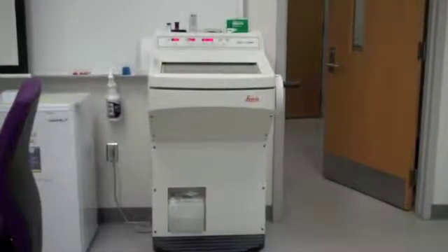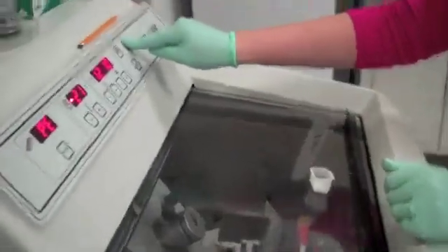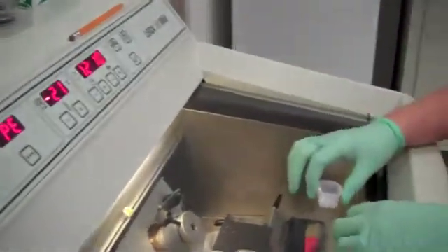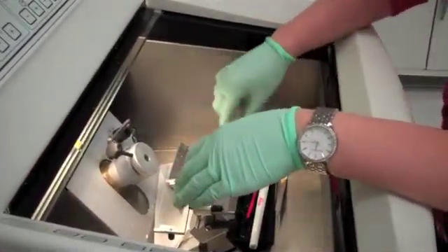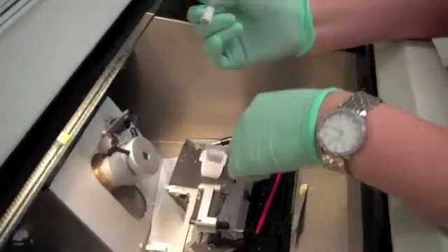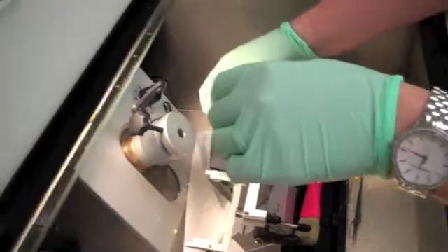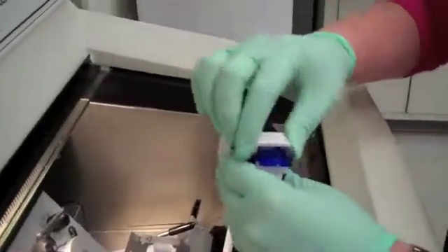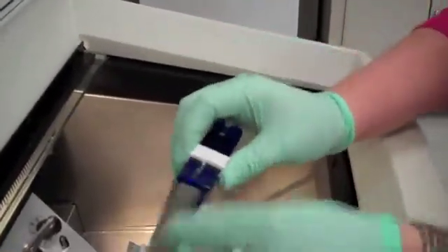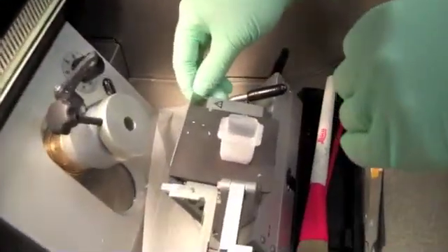While using the cryostat, make sure you are wearing gloves. Turn the light on inside the cryostat chamber. To change the razor, pull up the handle next to the blade to prop it loose. Using the brush with a magnetic tip, remove the blade. Put it in a container of used blades. Get a new razor, slide it in, and then push down the handle to lock it into place.